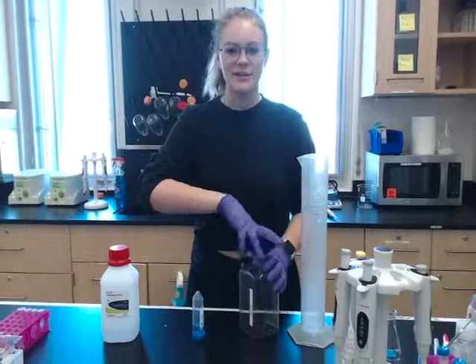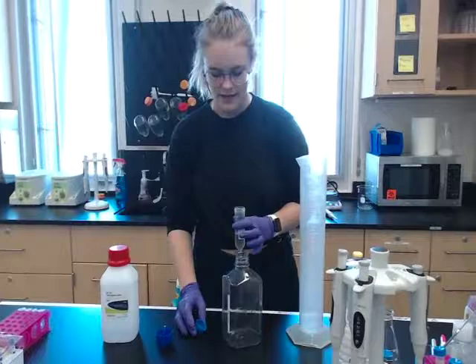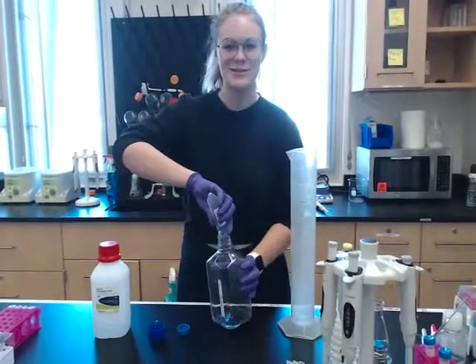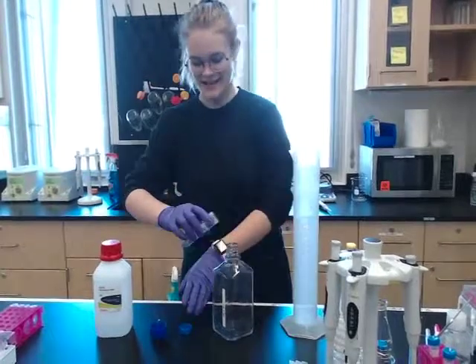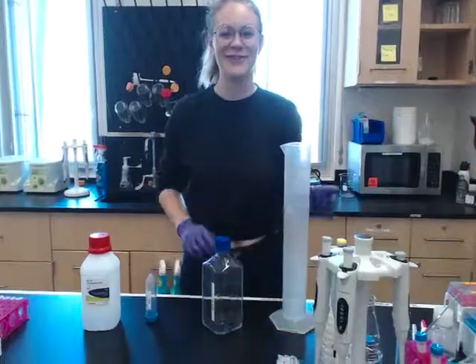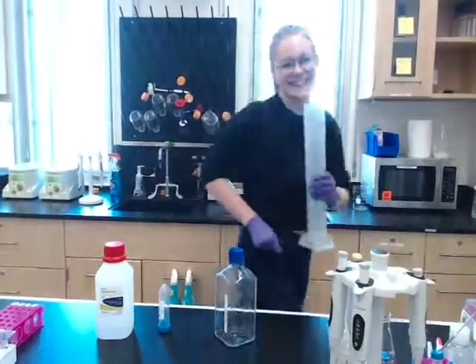So the first thing I'm going to do — pop open my TAE container, take my aliquot, and dump it right in. Now we're going to walk over to the DI water and get some DI water!